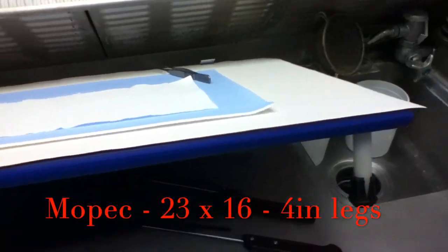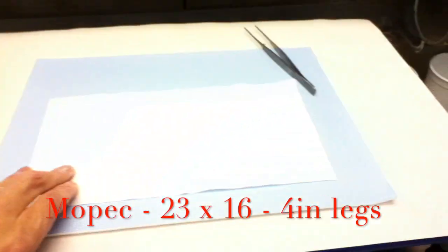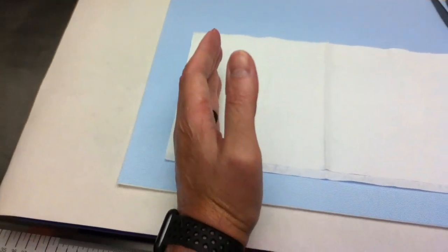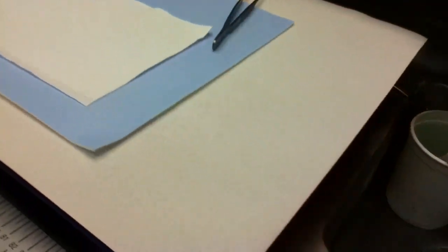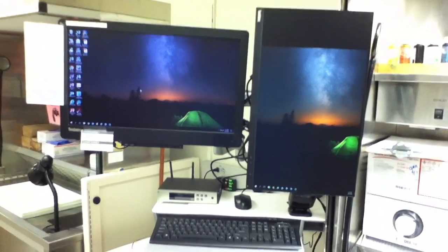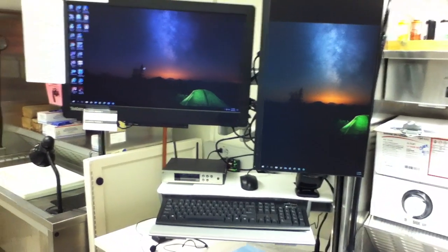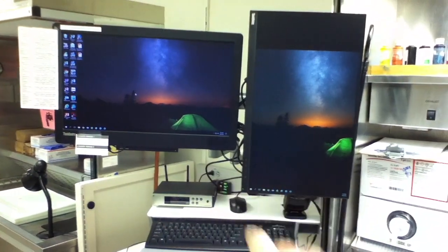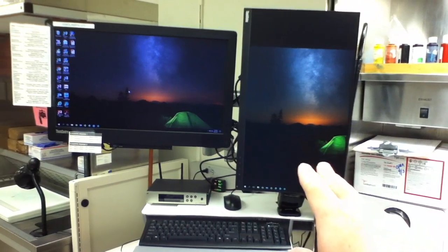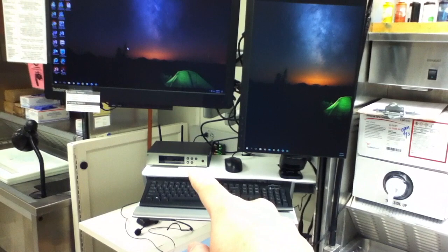This cutting board is from Market Lab. I like getting it up that way so I'm not down into the lip of the grossing bay — I can rest my hands there. I also like being able to store things underneath; I keep my long blades under there and they're not in my way. For my monitor setup, I have one in landscape and one in portrait position.